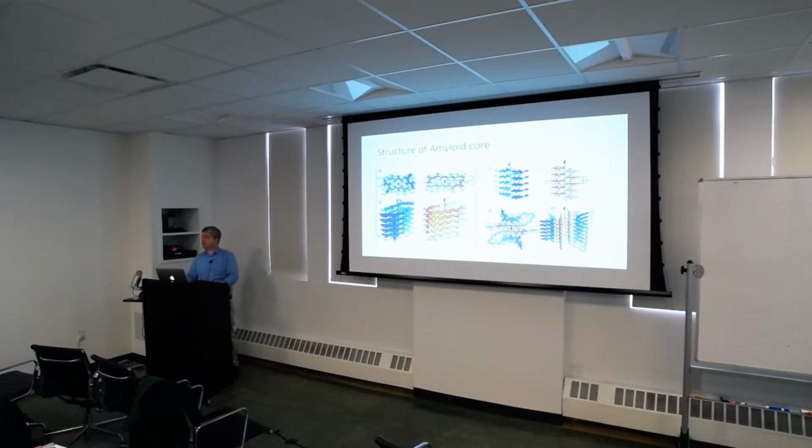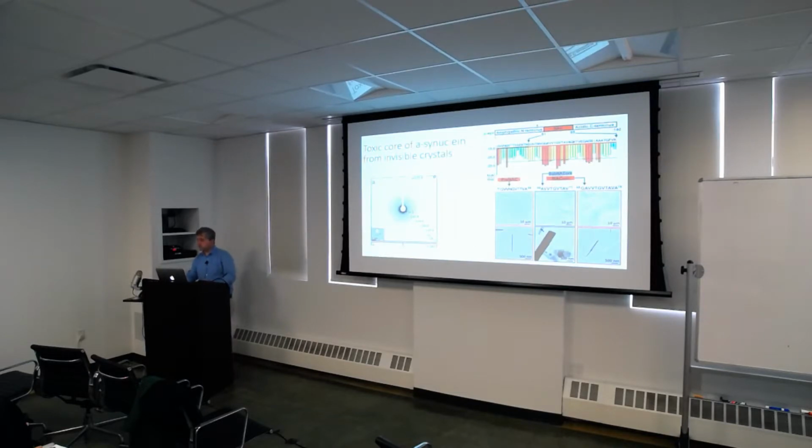Oh, yeah. So I heard that for doing MicroED, you are essentially limited to using tiny crystals. Yeah, they have to be thin. What is the reason behind that? I'll get into it a little bit, but basically with thicker crystals, you start to have more double scattering events, which don't obey the right optics, and also more inelastic scattering events, which also don't obey the right optics.